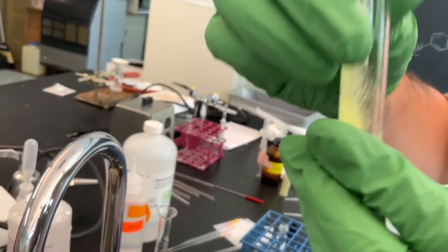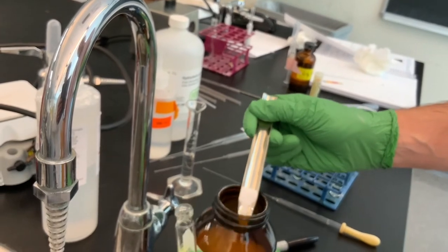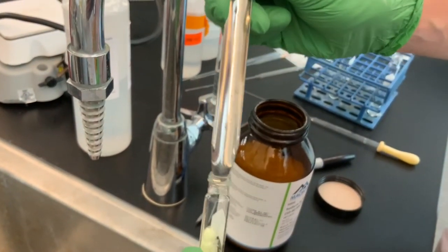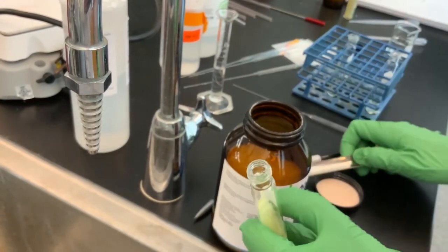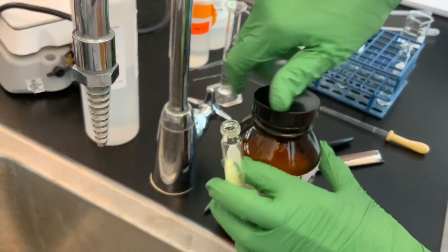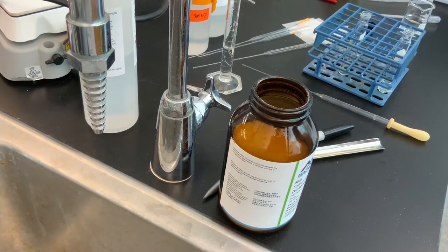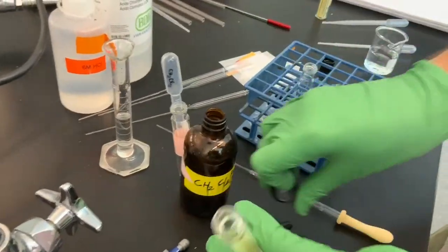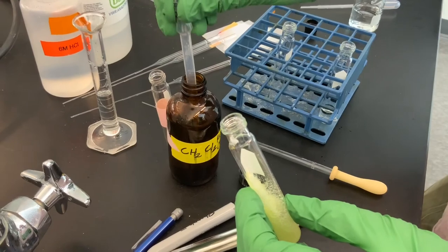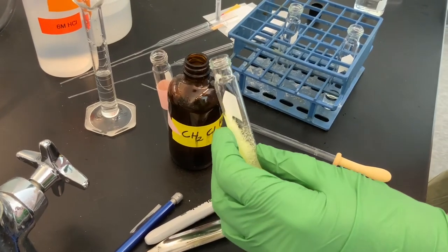So there you have it. I think if we wanted to, add a little bit more and then add some new, fresh methylene chloride. Just really want to get this dry because there was a lot of water present still. So I'm just going to add a little bit of methylene chloride here, just so we've got some more liquid to deal with, some headspace. We're evaporating off the methylene chloride eventually.